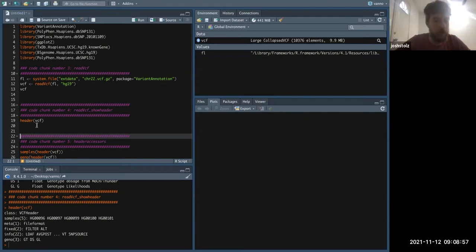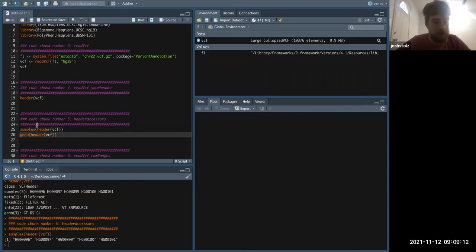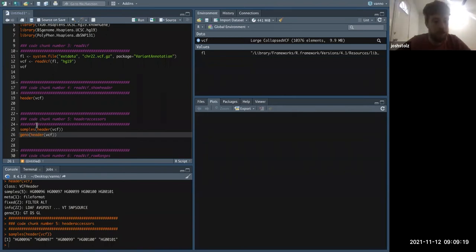There's a section of the header where that line gets stored, so you can view that to confirm if this is the most updated version. What's valuable here is the header also stores the samples, so this is an easy way to see we're working with five samples here. This is a relatively small VCF, so a lot of the problems we would normally have don't really apply.